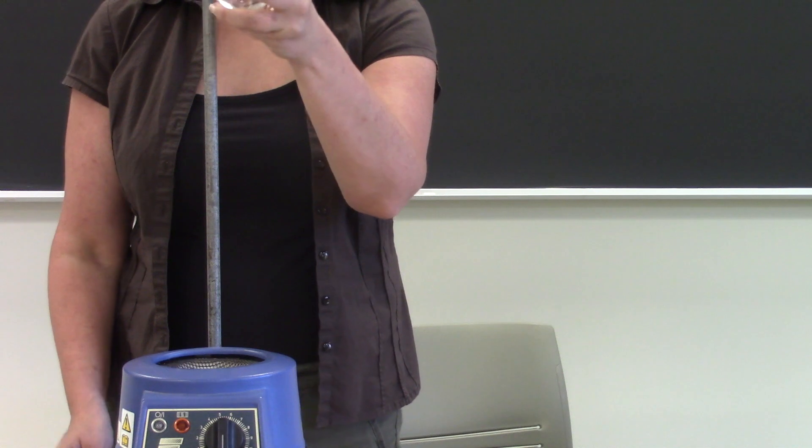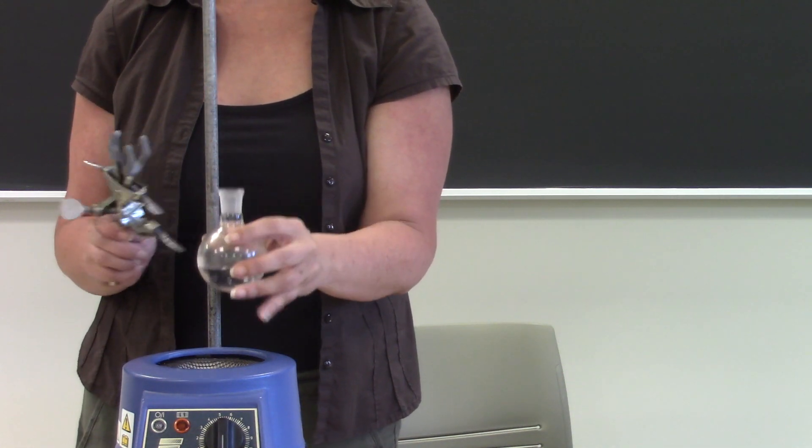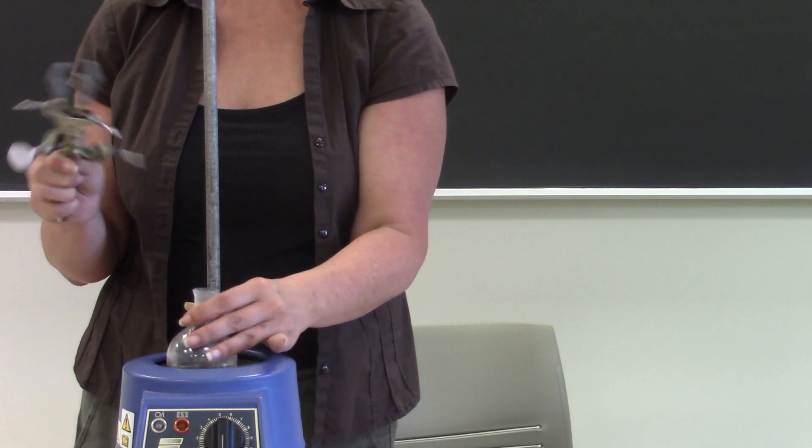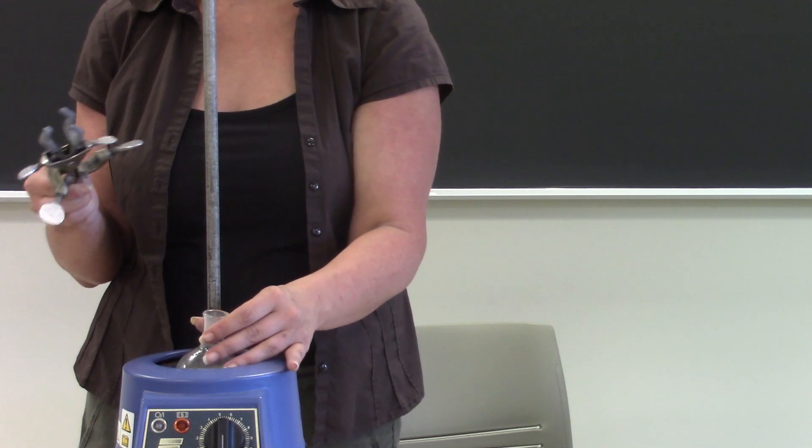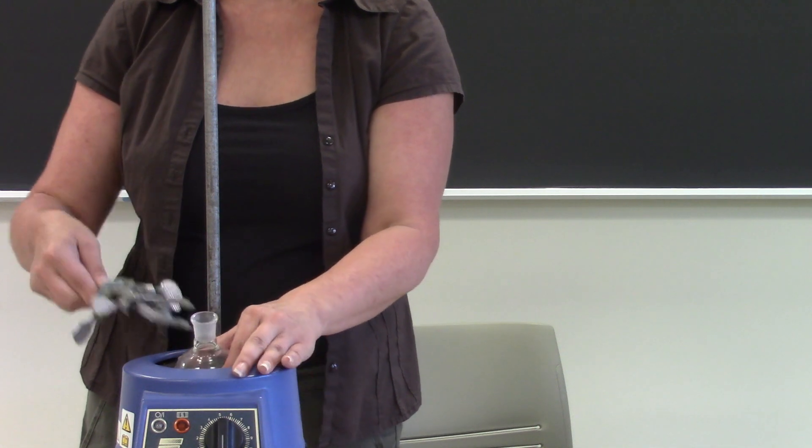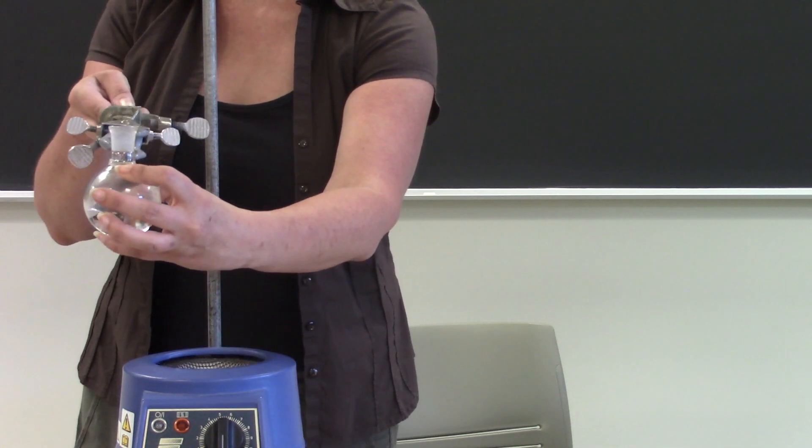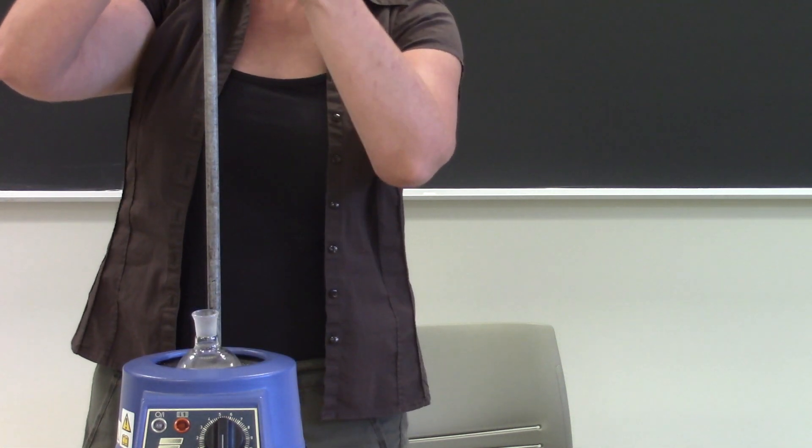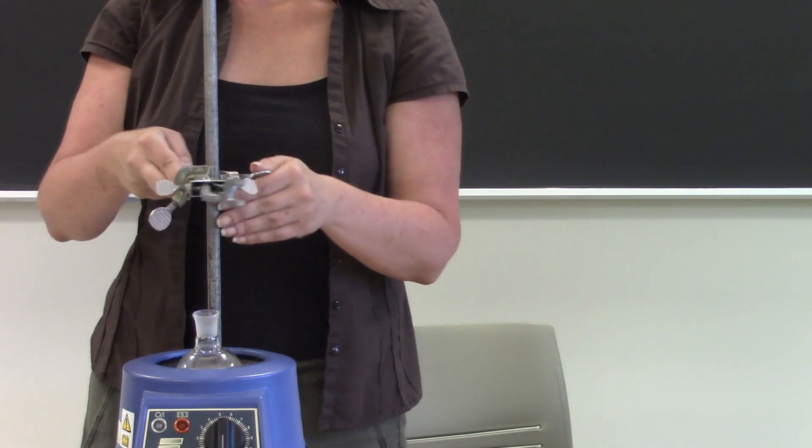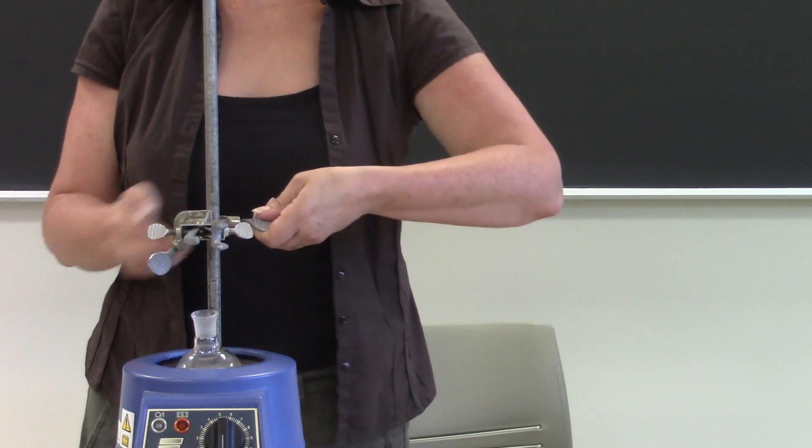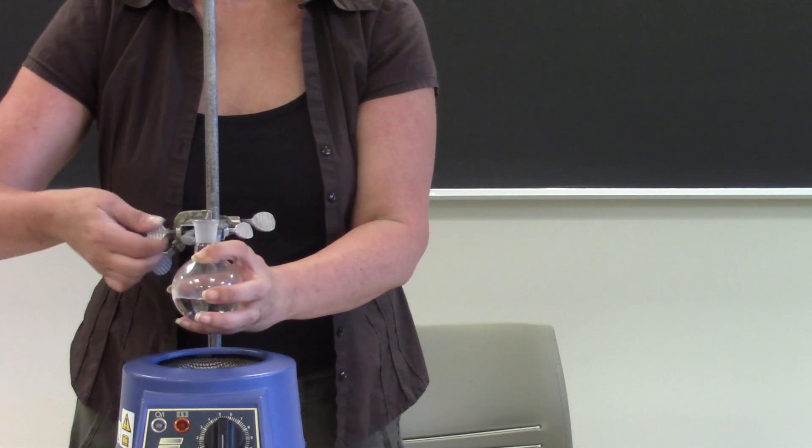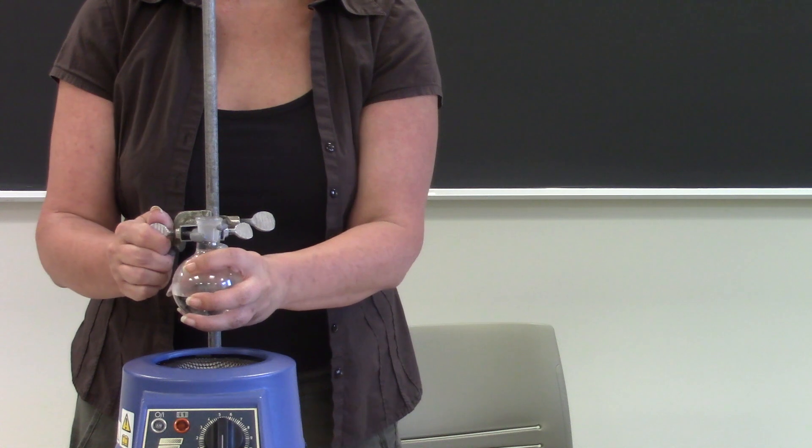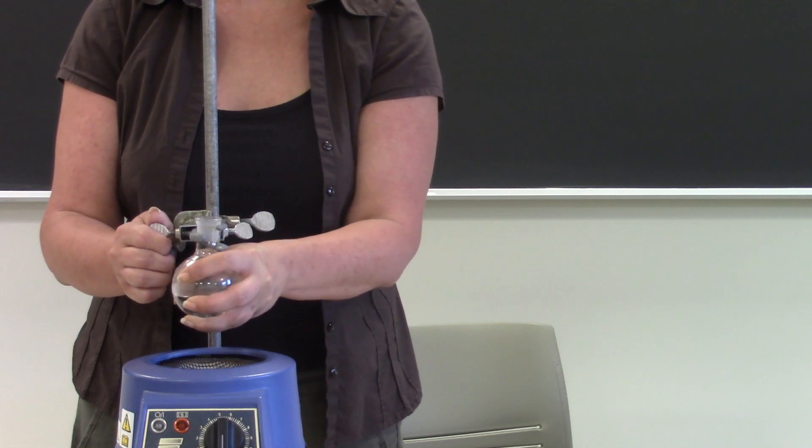So we do need to clamp this, the round bottom flask, very tightly. This is going to be the only clamp that is really tightly supporting the entire apparatus so make sure that you have a good clamp and that it fits the neck of your flask pretty well. So I'm going to go ahead and just put my clamp on and I'm going to clamp my round bottom flask to the ring stand really well so that is very secure.